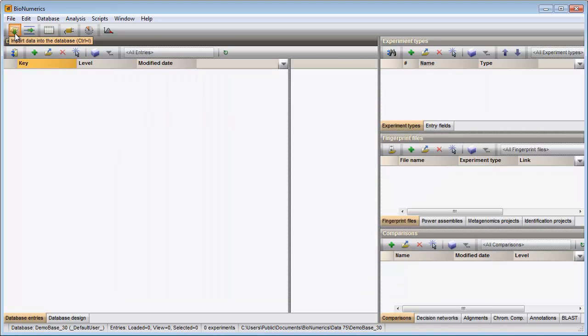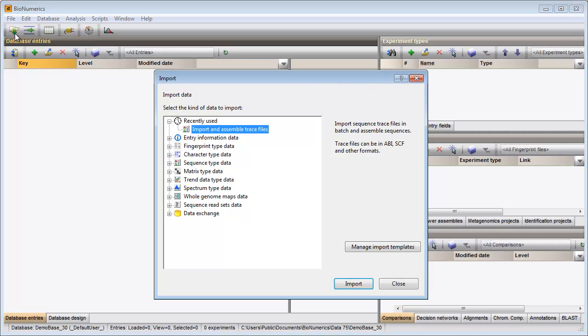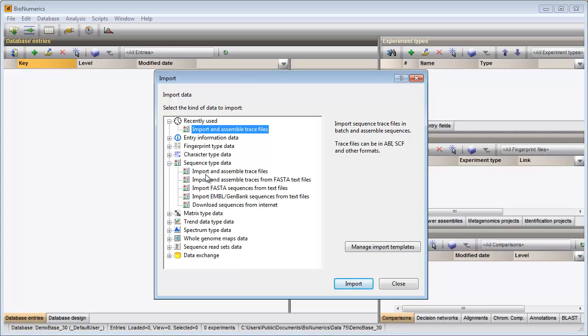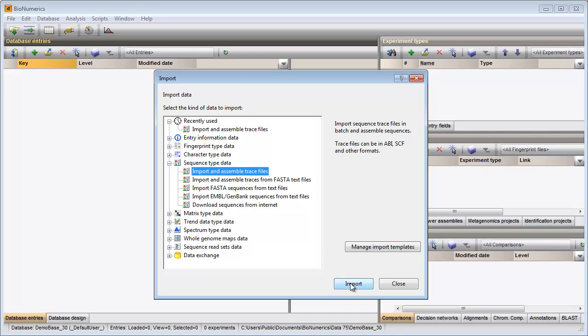In my example database I press the import button in the toolbar to call the import dialog. I select the option import and assemble trace files under sequence type data and press the import button.